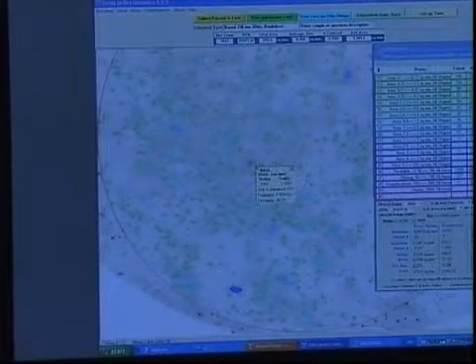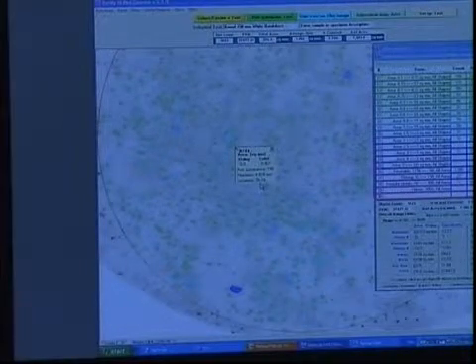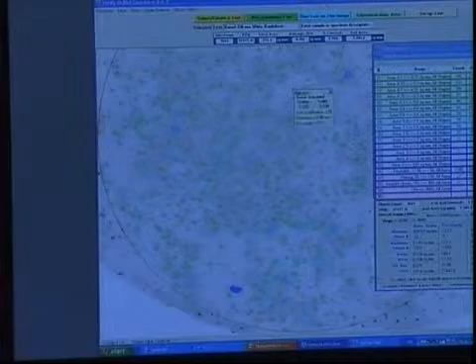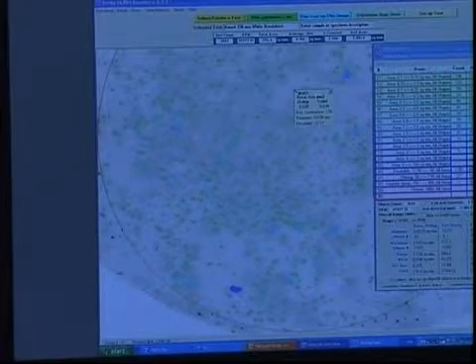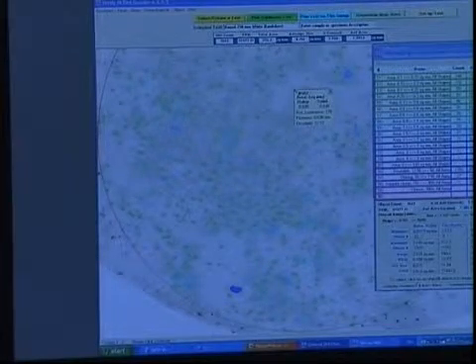I'll click off the zoom, and each one of these, each one of the specs, we can get the size of them and the luminance value, the perimeter, the circularity, and so forth. You can see that the small dirt here is circular. That's 12.57. So you've got a lot of data here that allow you to tune up the system and diagnose problems in the process.